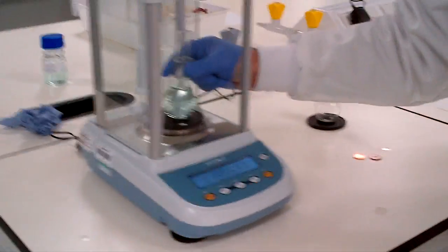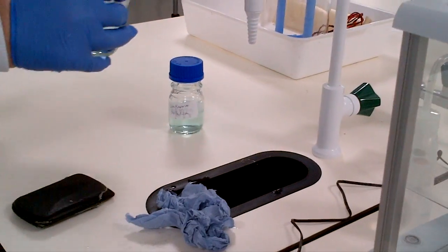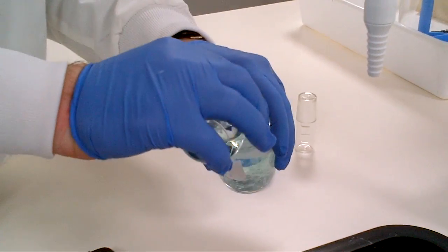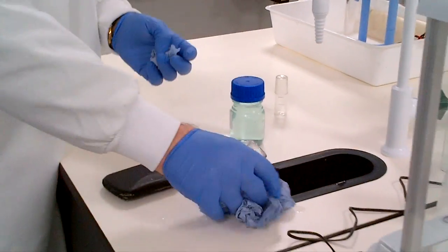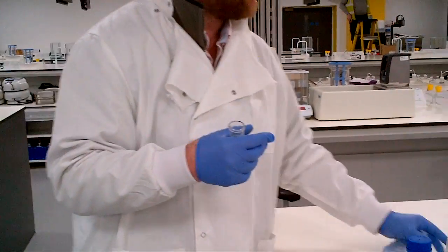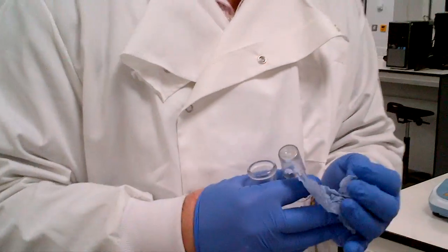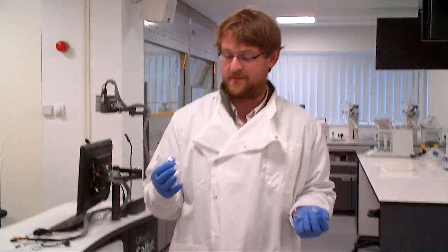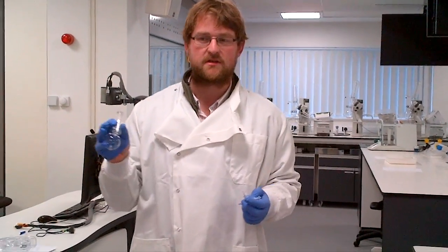And now we've done with our liquid, we're going to place the unknown liquid inside a residual bottle, place it there, and now we're asked again to clean this out with acetone. So, just to say, I know what the unknown liquid is for this practical. It could change year in, year out, so you might be looking at this in 20 years time and I'm an older man, but at the moment we're just going to use a surfactant, like detergents. So if we used an oil, we'd probably clean this out differently.